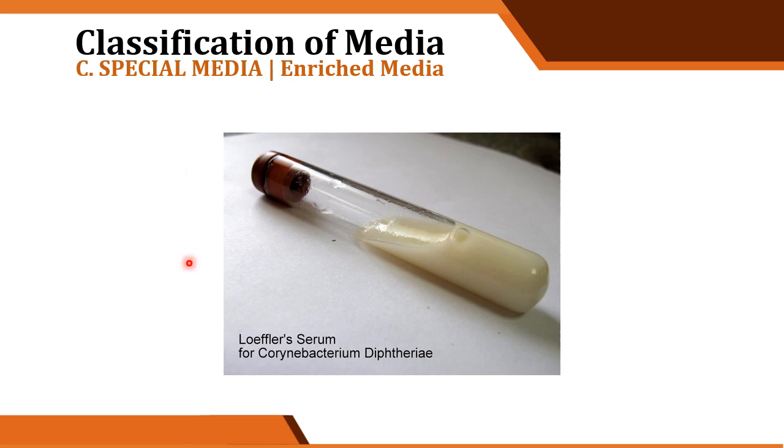Another example of enriched media is Loeffler's serum. Here, we added serum to the medium. It is used for isolation of Corynebacterium diphtheriae.